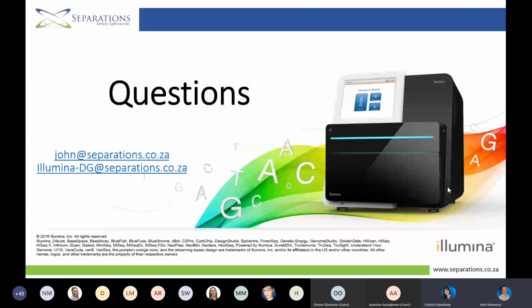And then Fadila would like to know, does Separations offer bioinformatics analysis or support? That's a very good question, Fadila. Thanks so much for the question. So Separations can obviously help you with your workflows. If you have, for example, an off-the-shelf solution that you need secondary analysis training or feedback on, yes, we can stand by you for any basic help or basic training in terms of your bioinformatic analyses. If you require anything further or more complicated than that, then it's still possible to organize that training for you with Illumina. Illumina can provide you with a custom training solution based on your bioinformatic requirements.